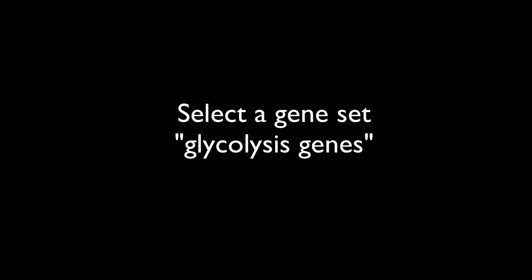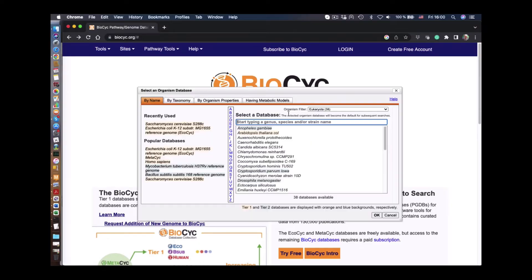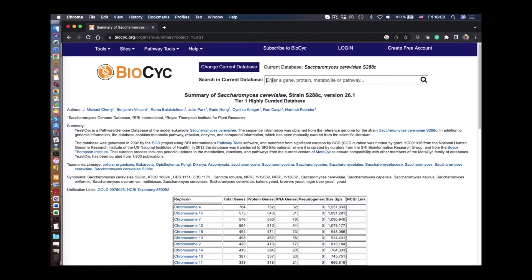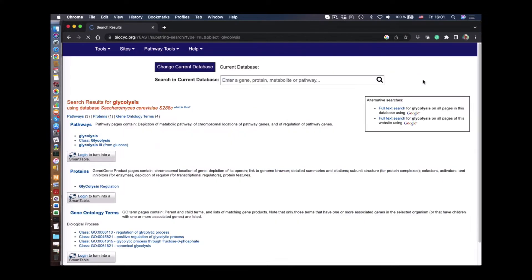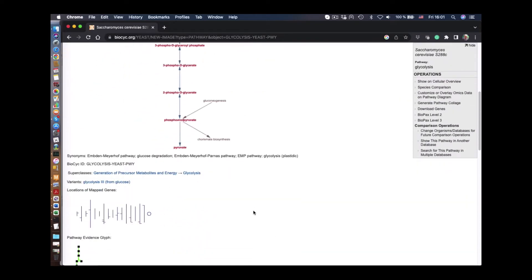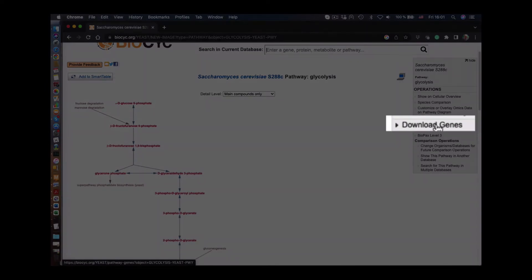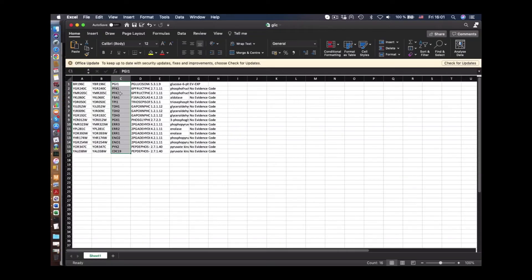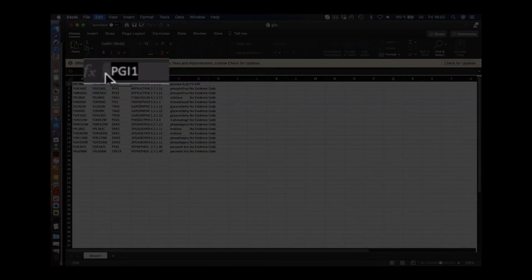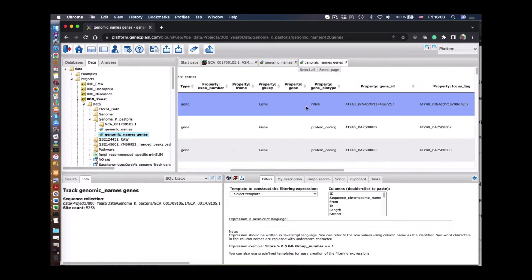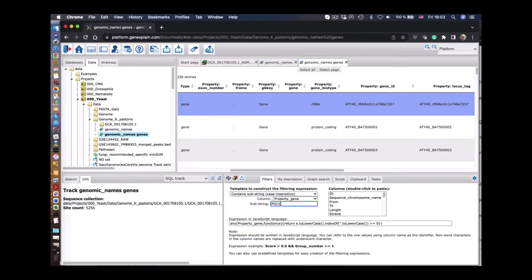Now we want to select a subset of genes for glycolysis. For that we go to the BioCyc database, select the yeast organism, and search for the glycolysis pathways. We find one pathway for glycolysis. We can download the gene list for that pathway and copy it into an Excel file, selecting the names of those genes. In the annotation file we see that there are gene names in the property 'gene'.